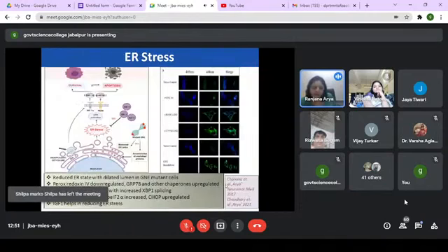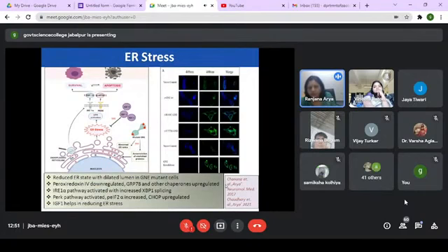Similarly, with the ER stress, we have identified some of these molecules, where we can determine how the ER stress redox potential is altered in the various mutant cell lines. You can see the ratio between these blue and green signals that were altered in the mutated cell line, and treatment with IGF-1 again lowered the ER stress that was observed in this cell line. Next, please.